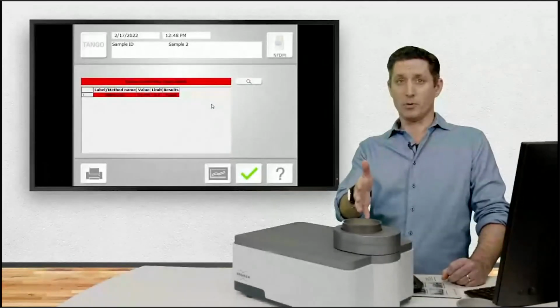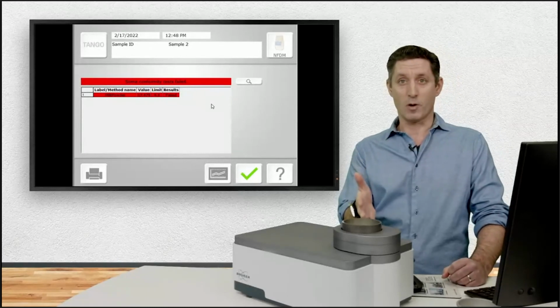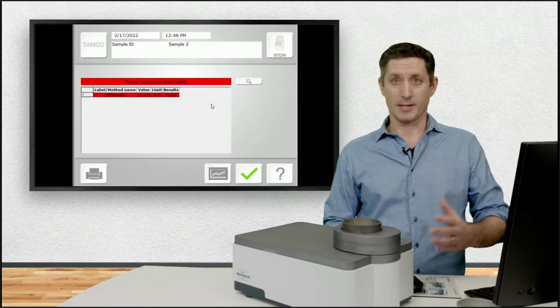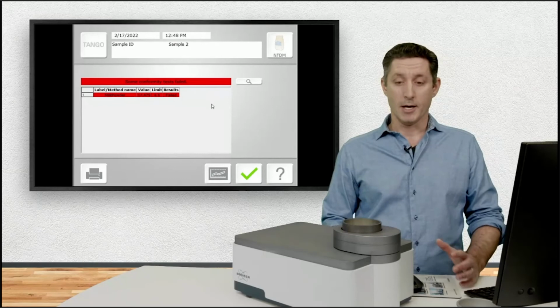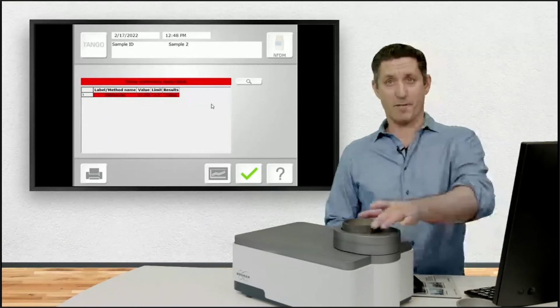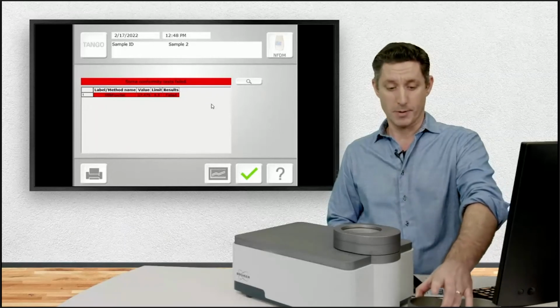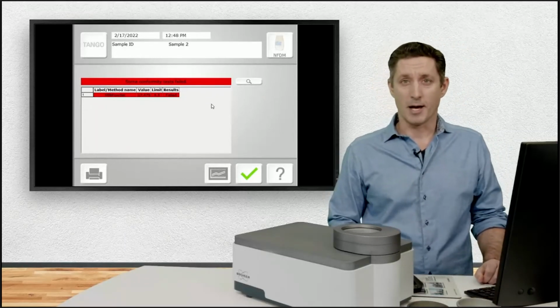But you can see that this sample is red, which means that something about it doesn't conform. So this would be a candidate for sending to a company like CPS for further evaluation with a technique like MALDI to more positively identify the specific contaminant responsible for the failure of the result. And with that, I'll thank you for your time and I will send it back to Pierre.